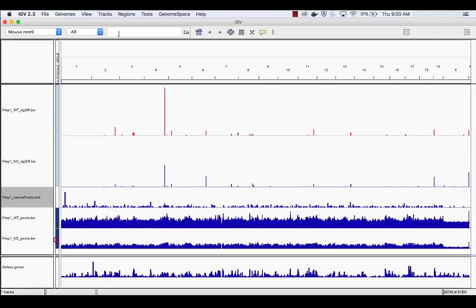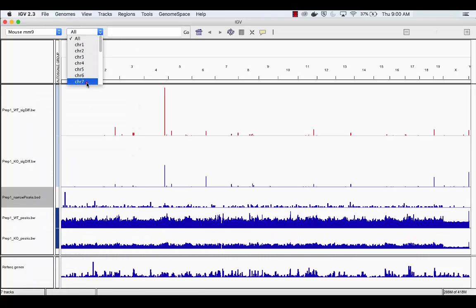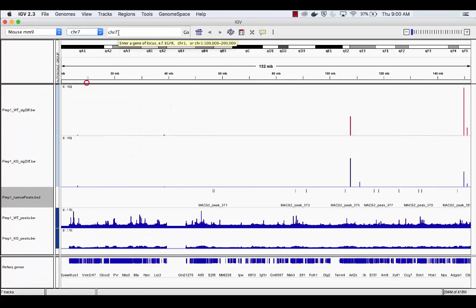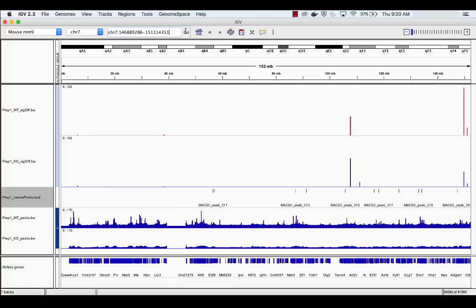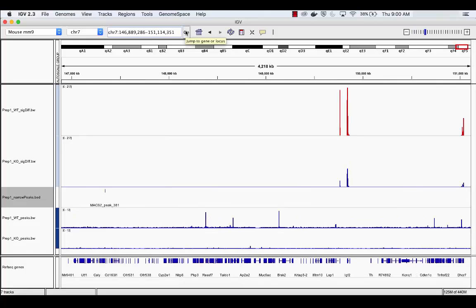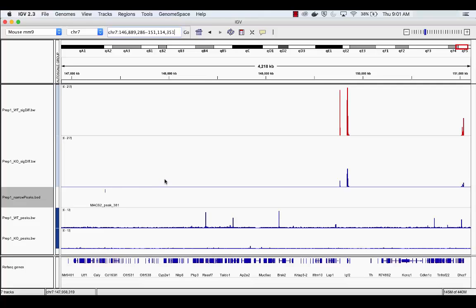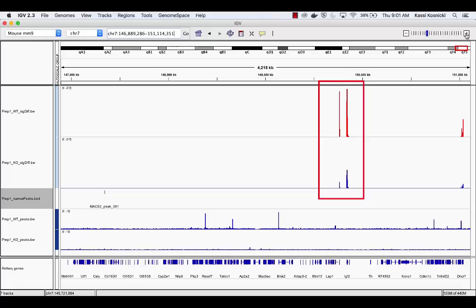For the sake of demonstration, we will observe a region on chromosome 7 that illustrates the differential gene expression of the gene IGF2, a gene known to promote the growth and proliferation of cells. In the top two tracks, you can already identify the differential expression between samples. In the third track, you can see its corresponding transcription factor binding site.